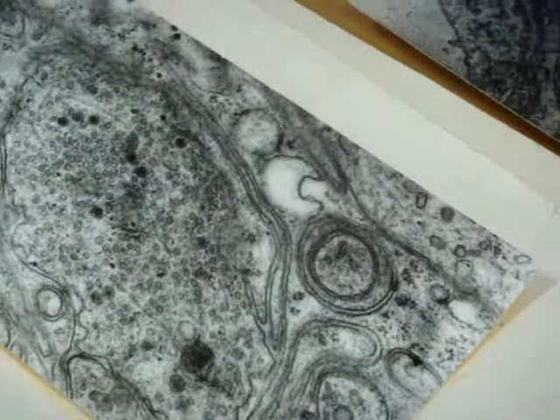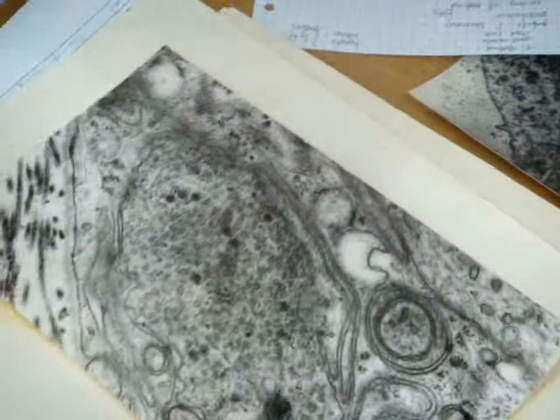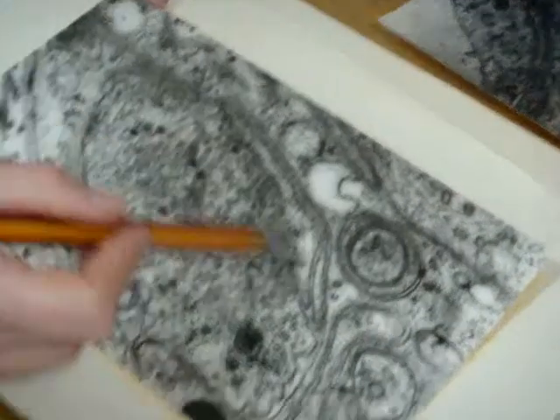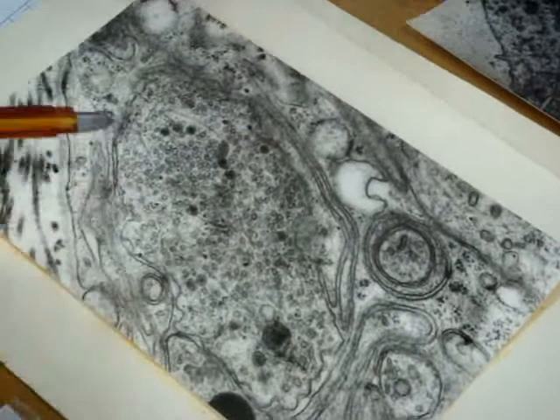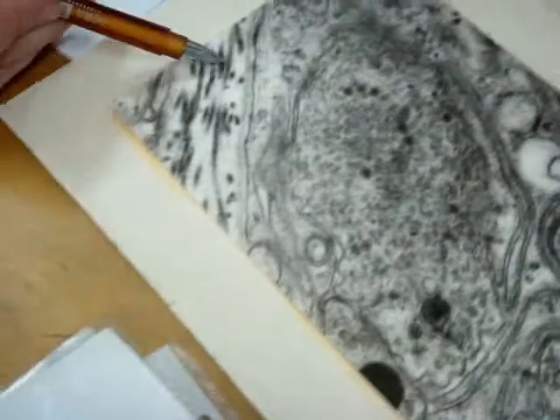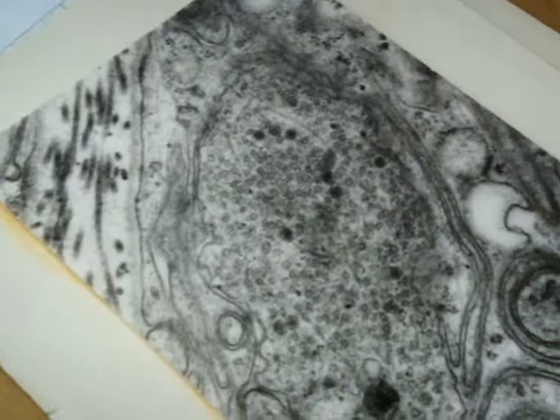For example, the terminal forms a synapse on the body. If we cut through here, we can see the structure of the synapse, but we cut it a bit upper. That's why we can't see the presynaptic membrane and synaptic cleft. We can see only the process with mediator, with transmitter. Is it clear? I can say these are collagen fibers outside of the basement membrane. Other, neuropil.